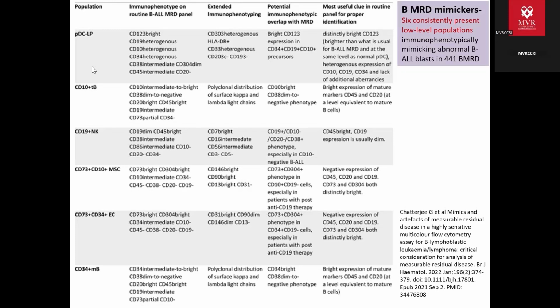So the challenges are the sample quality, as I told, and the immunophenotypic shift. And then the introduction of immunotherapy, especially that against markers like CD19. This will require modification of the panel. We need to have different antibodies. As of now, we have not standardized CD19. So if the clinical side says that they are starting anti-CD19 or CAR T cell, then we will have to procure more antibodies and improvise our gating strategy.